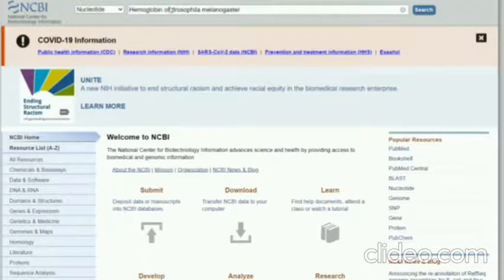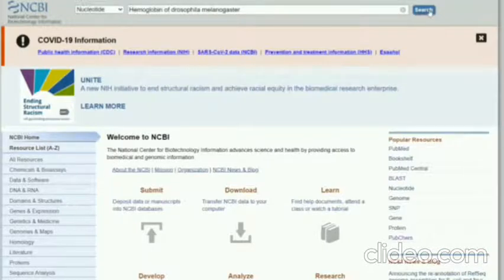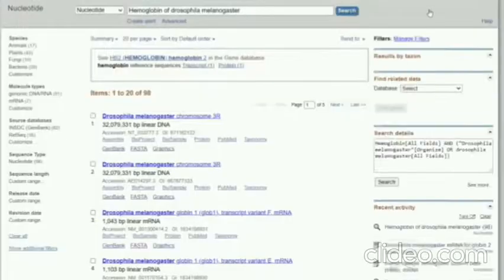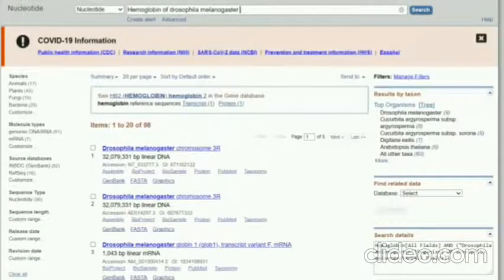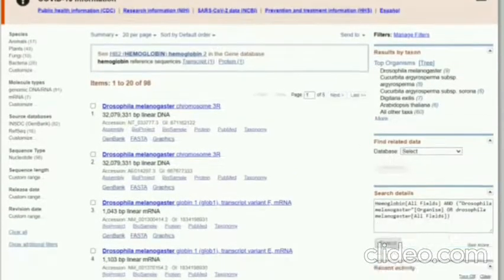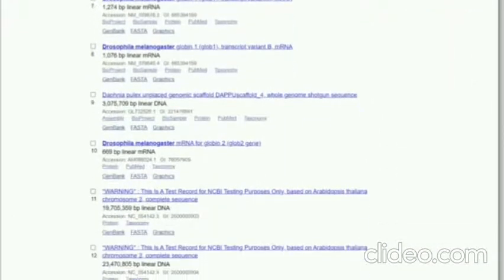I'll search for Drosophila melanogaster hemoglobin and enter search, because you need a FASTA sequence to put in the AP tool. So I am going to take a FASTA sequence of Drosophila melanogaster hemoglobin. I am going to take this one.